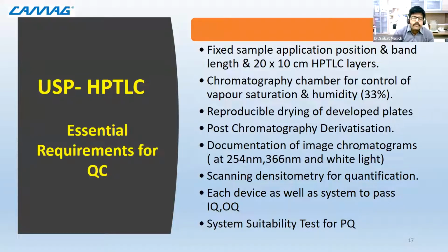And then we move forward to the next part, that is post chromatographic derivatization. Post chromatographic derivatization is also equally important. The aspect is very small, but it is highly influencing. Why? Because I am adding a chemical onto the plate, then I am giving some external support to enhance or accelerate the reaction. In many cases, heat is being given for the reaction to get completed.